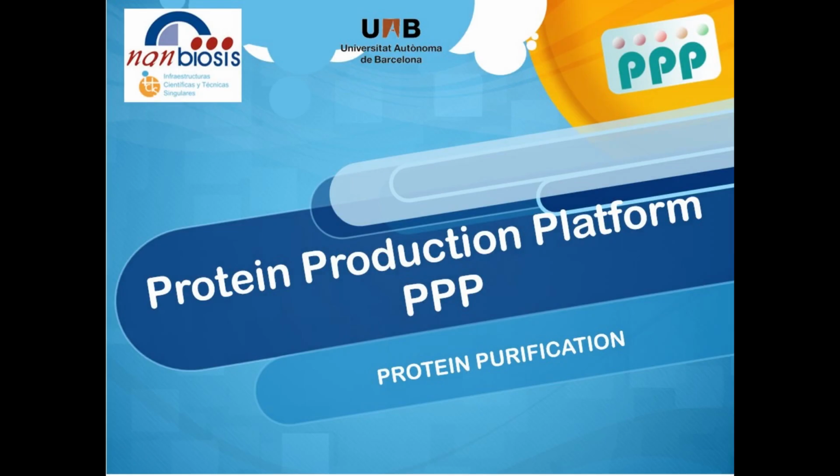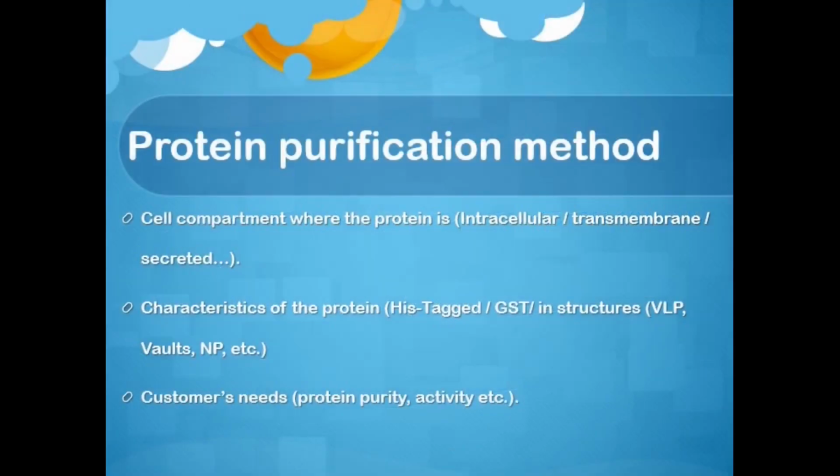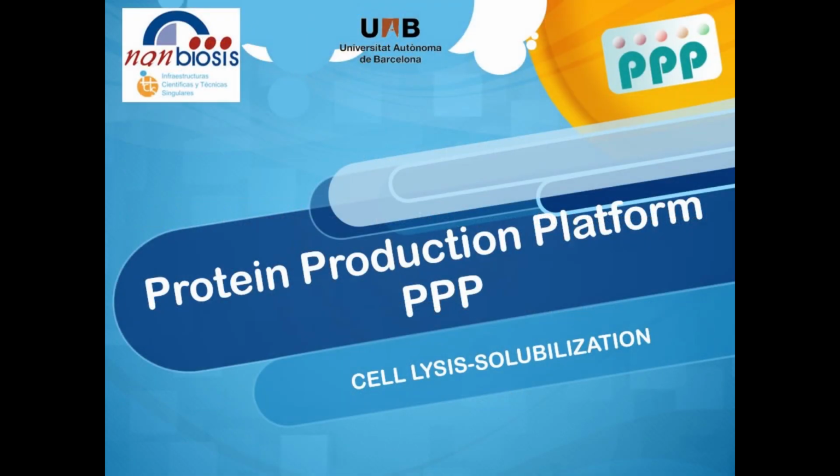Protein purification. In this section, we are going to explain some purification methodologies that are carried out in our service. There are so many methods that can be applied to purify proteins. The chosen method depends on several factors such as the cell compartment where the protein is, the protein characteristics, the needs of the client in terms of purity, activity, etc.